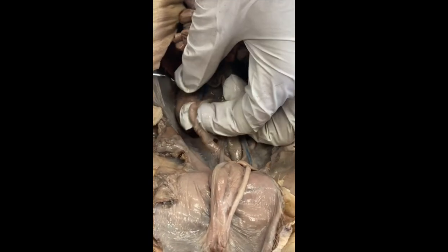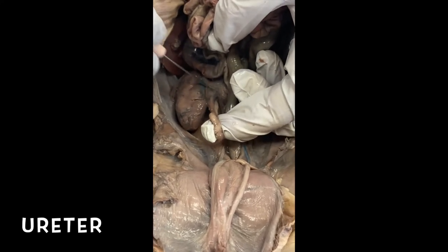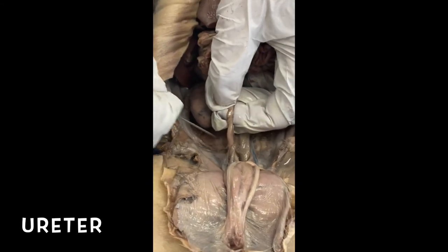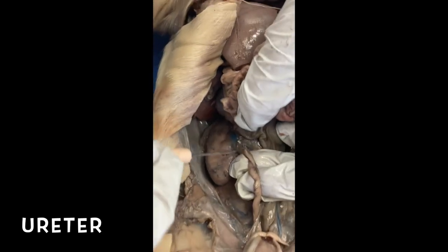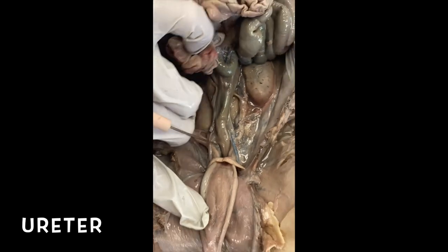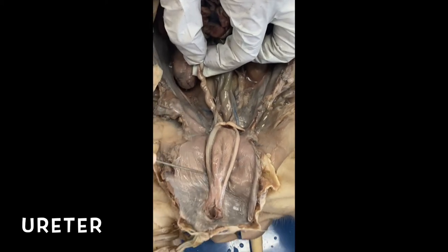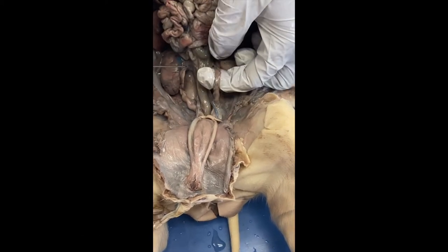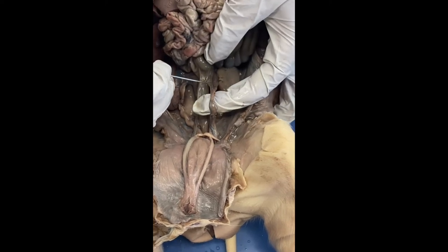I was telling Fleming how big the ureter is on this one. Sometimes it's hard to find. So remember, kidneys are filtering out all of our toxins and things as we get ready to excrete them. This ureter attaches here, takes urine out, and it's going to come in here. Comes in right there, all the way from the kidney. We can follow it here into the bladder before it comes out. Here we are on this side. We have another ureter. Huge. I think this pig had a nice excretory system here.